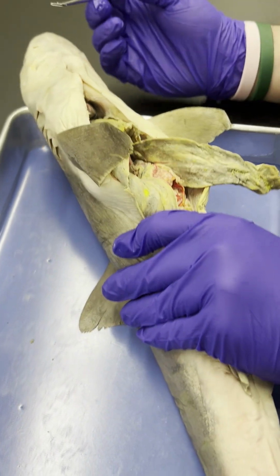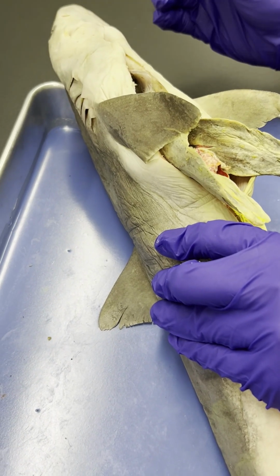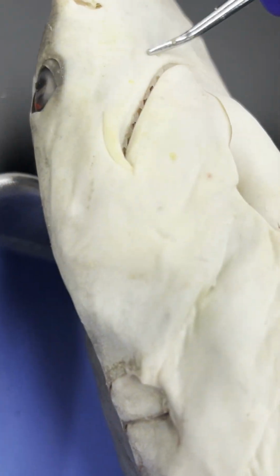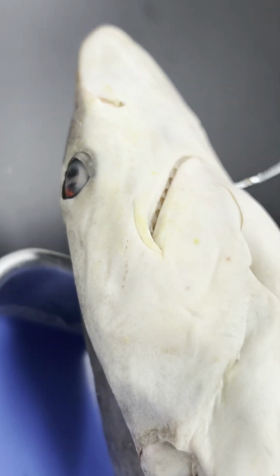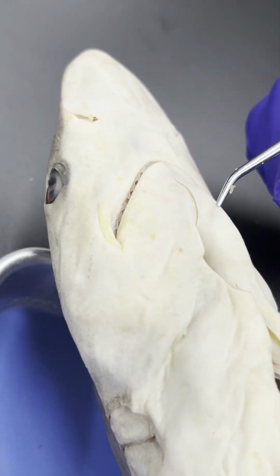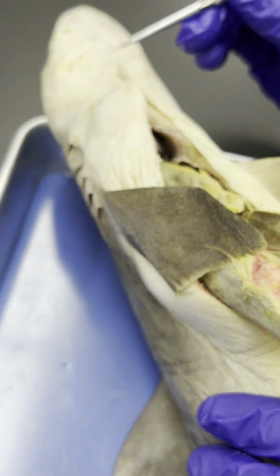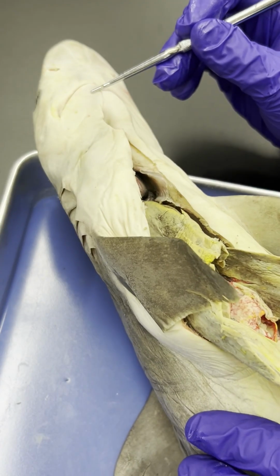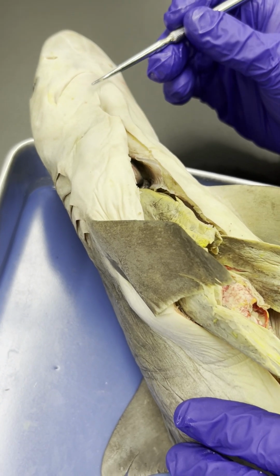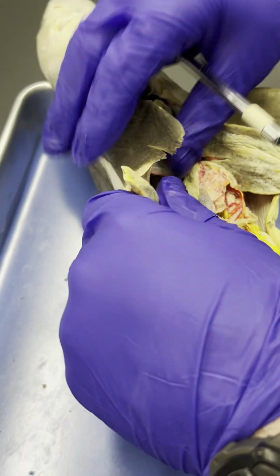Okay, so the digestive system. The first part of the digestive system, which many people are not aware of, but intuitively, it's actually your mouth. So here's our shark. The shark is going to ingest food. Once that food breaks down and gets fully ingested in the mouth right here, it's going to go down the esophagus, which we're not going to show you guys or have you guys dissect out for this lab. Food that's ingested and going down the esophagus is called the bolus. So the bolus will eventually come down the esophagus and then make its way into the stomach.